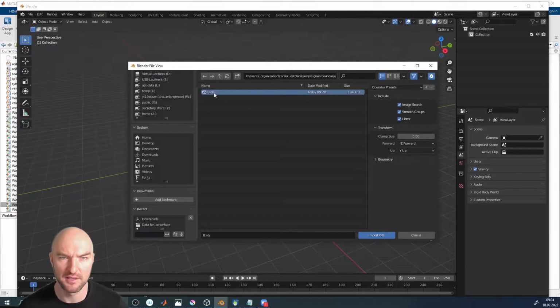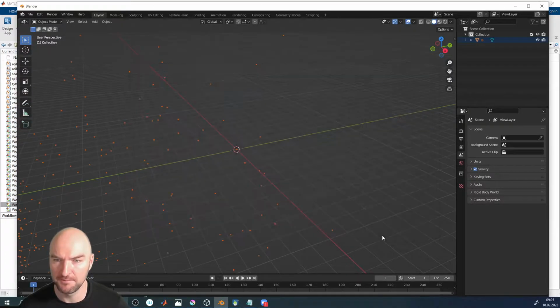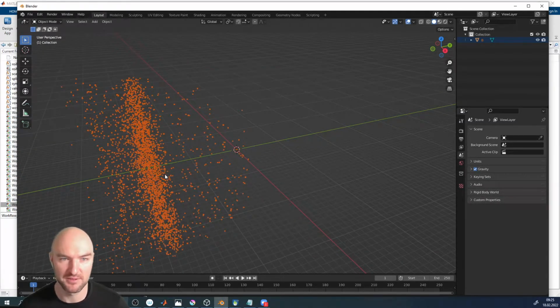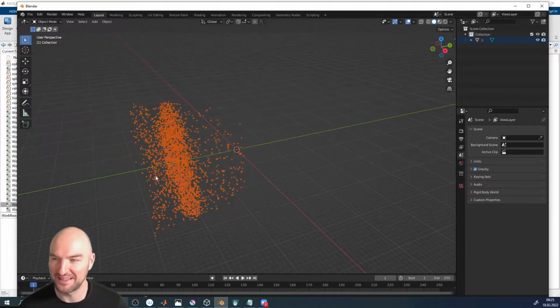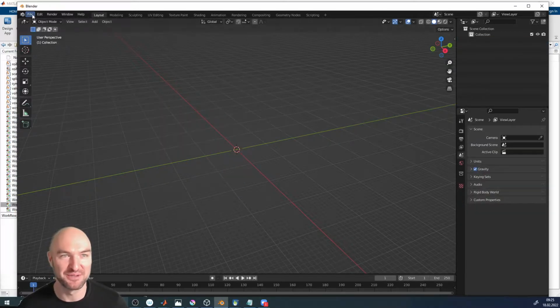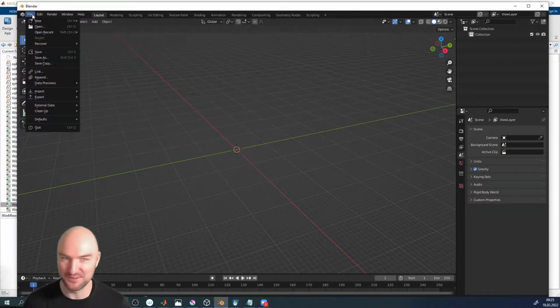Simple grain boundary. And we've got our Boron OBJ. And if I now click import, you're going to see, oh, they've got rid of them. It used to be that if you did that, you needed to click to preserve the vertices. Sorry, I wanted to show you that it doesn't work, but it works now.